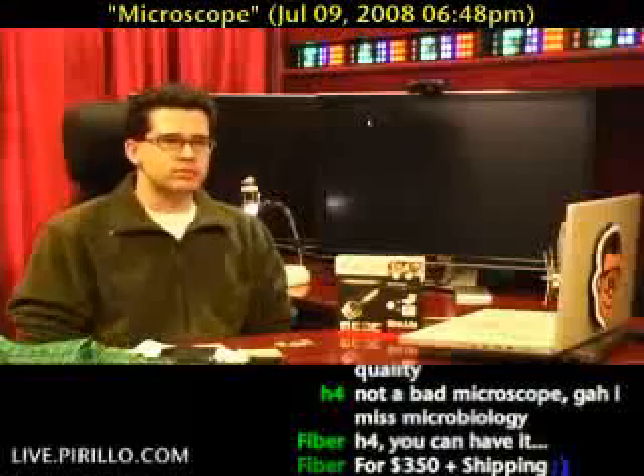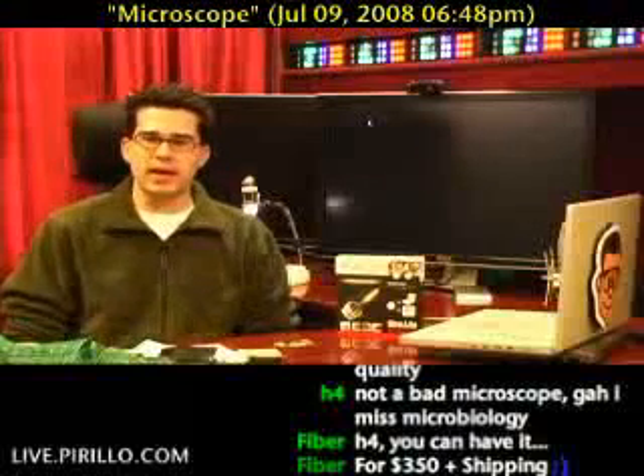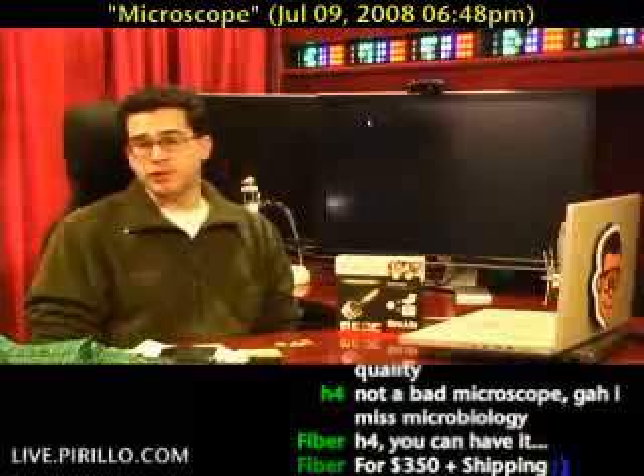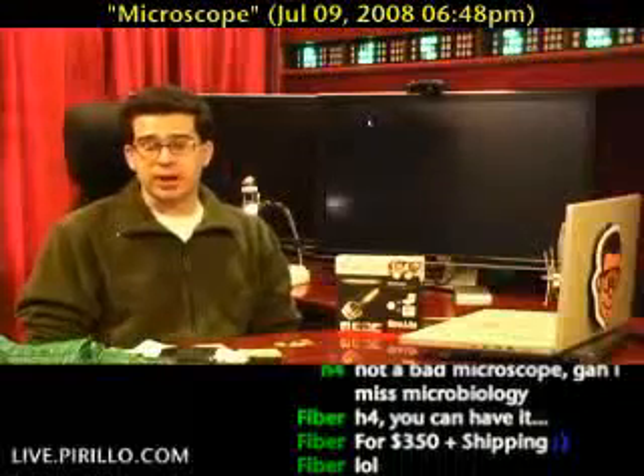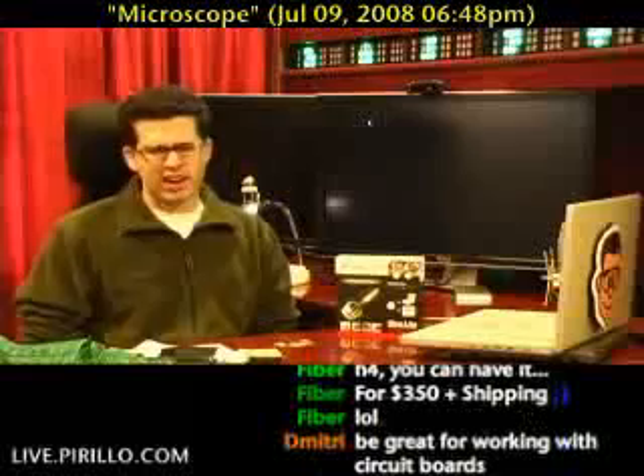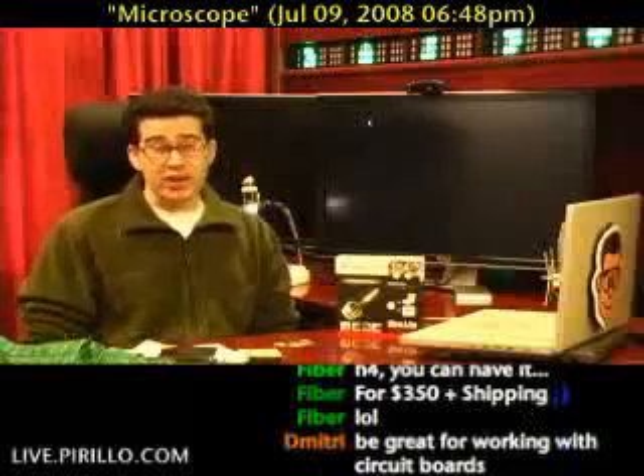You might remember a few months ago when ThinkGeek sent me a USB microscope to review. That particular unit was designed with kids in mind. It was nice, but resolution wasn't all that high. Neither was the frame rate. The software was relatively janky, and I couldn't even get it to work with a Mac.